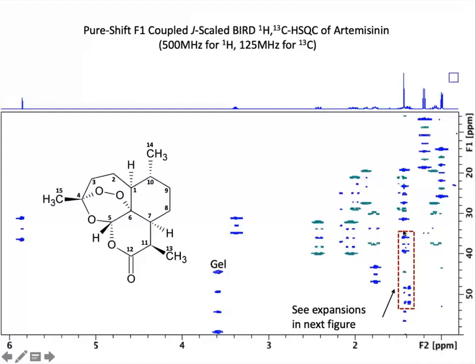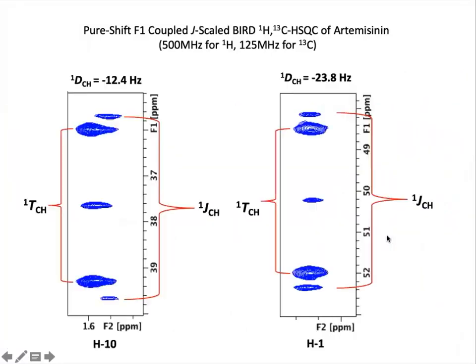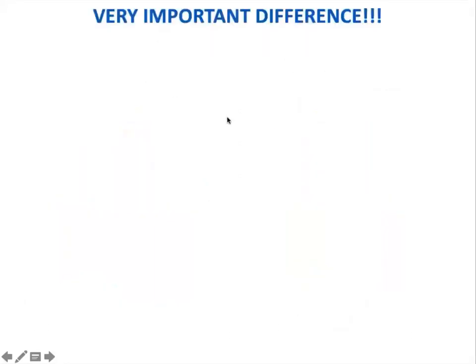So these also we can measure for the CH2, for the methylene groups. And if you get overlapping, well, go to the one with chemical shift evolution in F1. And then here again, you will get a chemical shift. You will separate by chemical shift. You get the total coupling inside, the J coupling outside, and you can measure the RDCs as shown here.